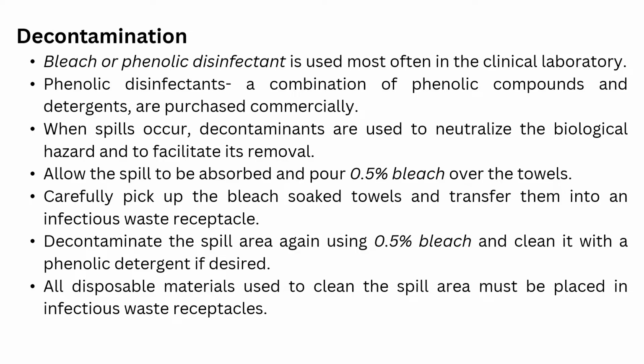A bleach or phenolic disinfectant is the most common disinfectant used in the clinical laboratory. Phenolic disinfectants are a combination of phenolic compounds and detergents and can be purchased commercially. When spills occur, the disinfectants are used to neutralize the biological hazard and to facilitate its removal. You allow the spill to be absorbed and pour 0.5% bleach over the towels.